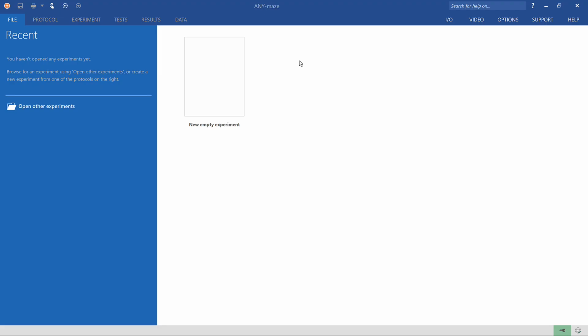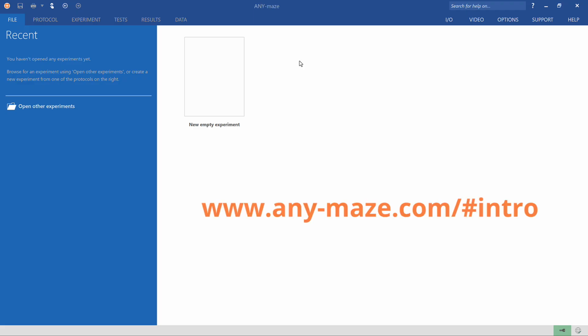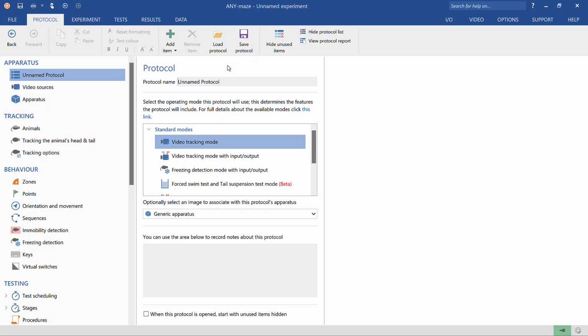In this video, I'm going to walk you through how to set up a basic Morris water maze experiment in AnyMaze. If you're new to using AnyMaze, I recommend you stop here and watch our Intro to AnyMaze video first, which you can access from our website.